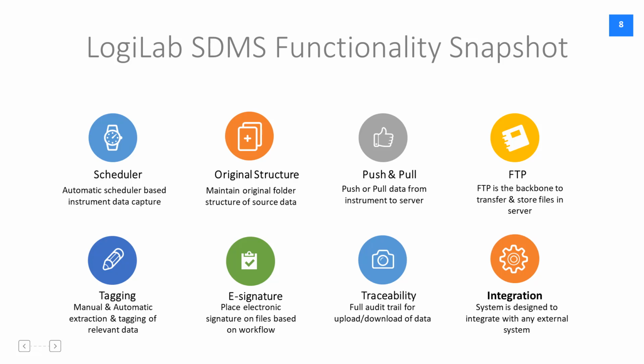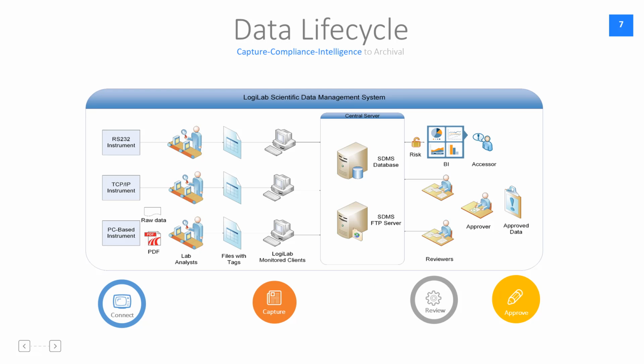It has the appropriate SDKs, APIs, and RESTful services available so that external systems can be integrated along with LogiLab SDMS. This slide gives you an idea about the data lifecycle inside the LogiLab SDMS. Instruments start generating data, and these data are creating files, and these files are being stored in the central repository.